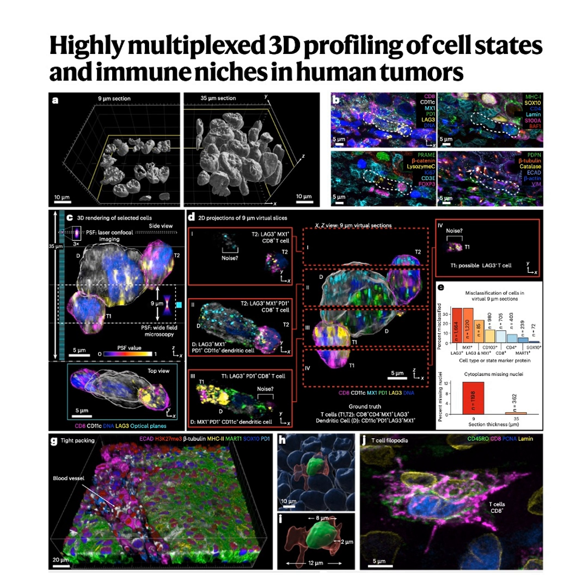Yes, exactly. Because they could measure 10 different lineage markers on T cells simultaneously in 3D, they could get a much more nuanced picture of T cell identity. And what they found were overlapping transitional states. T cell identity wasn't always clear-cut. Cells existed on a spectrum. A key example involved a specific subset called progenitor-exhausted T cells, or TPEX cells.